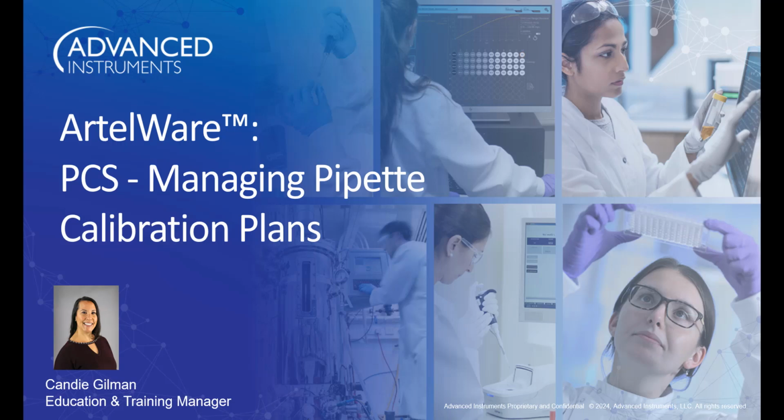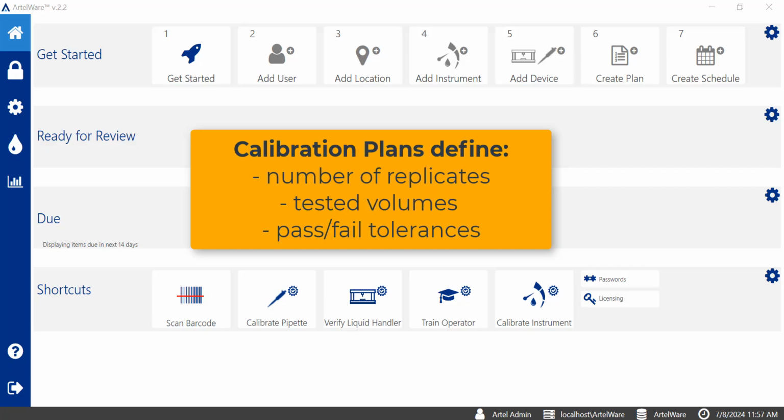Thank you for joining me for this brief tutorial focused on managing Pipette Calibration Plans for use with the PCS instrument in our ArtelWare application. I have a lot of information to share with you, so let's begin.